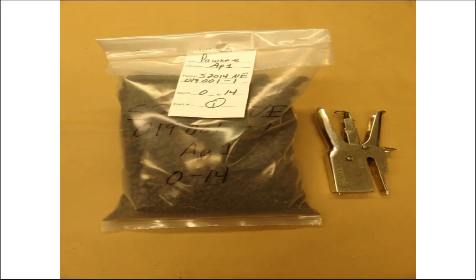We've listed all the requirements on the tag and the bag. We've got the soil series, the horizon designation, the user pedon ID with the layer number, the depth, and then that field number that Steve was talking about. And these bags, just so you know, we want you to ask us for the bags.